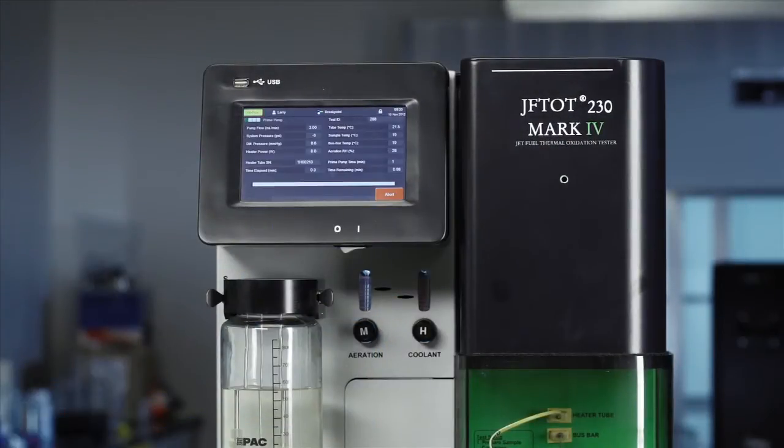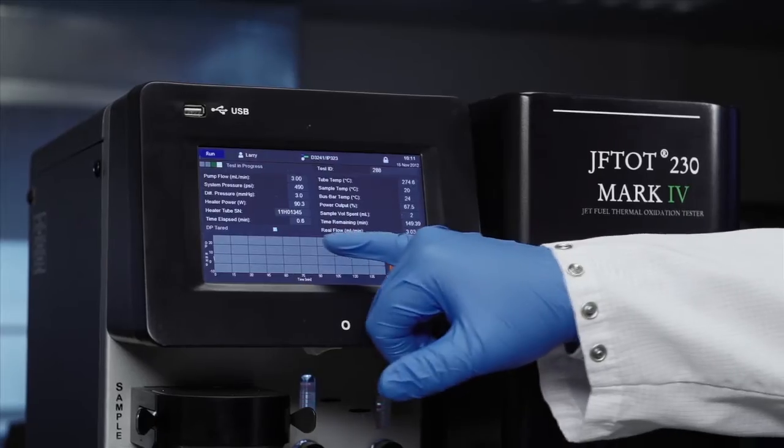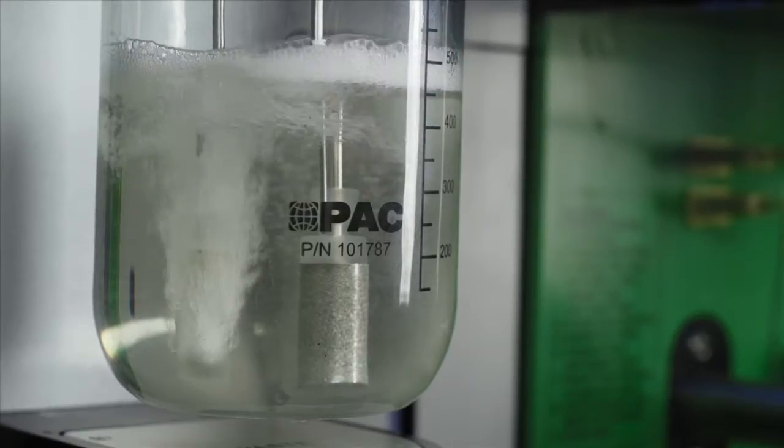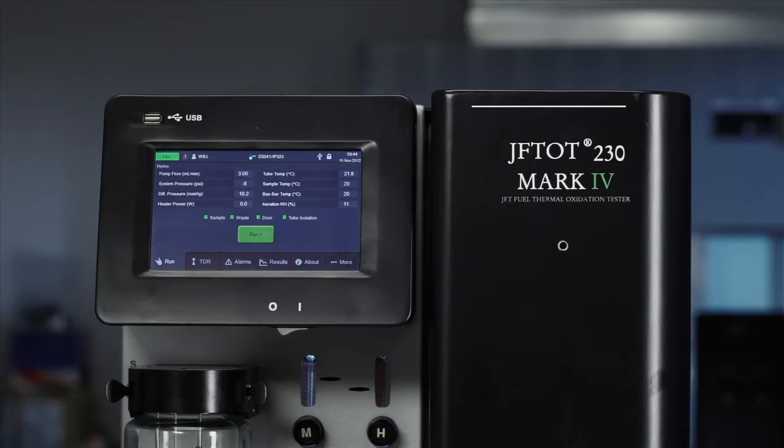Activities like priming the pump, measuring the sample flow at the beginning and end of analysis, and aerating the sample are now automated. And once you've prepped the sample, you just need to press Run to start the test.